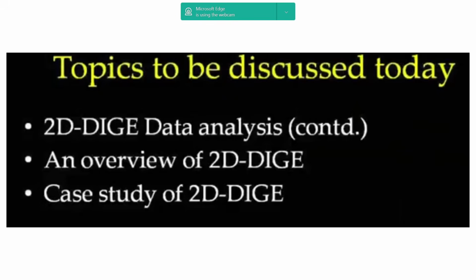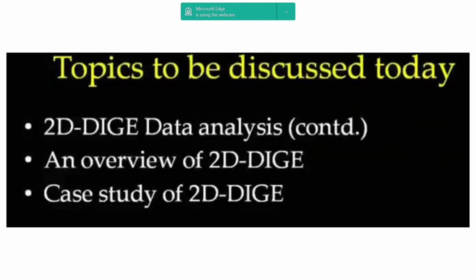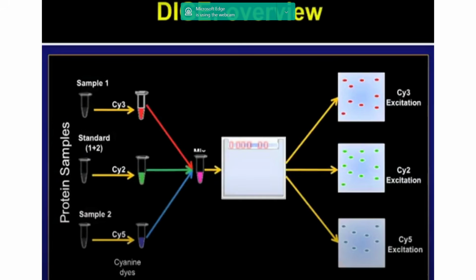So that was the second part of the lecture, whereas in the third part of the lecture, Sir talked about how exactly DIGE can be analyzed. Now you know how exactly this has been prepared and how they performed 2D electrophoresis after labeling, so it becomes the DIGE technique. And now you have visualized the gel by giving different excitation and emission wavelengths. Cy2 is generally the standard, as we mentioned. Cy3 is red and Cy5 is blue.